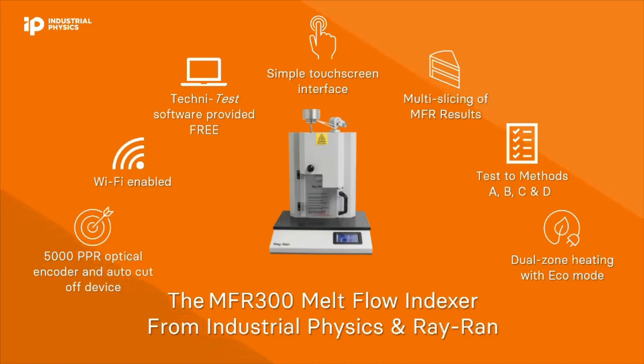Features including Wi-Fi connectivity for results capture, Technitest software supplied for free as standard, and the intuitive icon-driven user interface make the MFR300 a versatile and accessible return on investment, providing detailed results through multi-slicing of melt flow rate data and built-in procedures for all the testing methods from the common international testing standards. Dual zone heating and a power-saving eco mode make the MFR300 accurate and efficient in its operation, suitable for any laboratory.